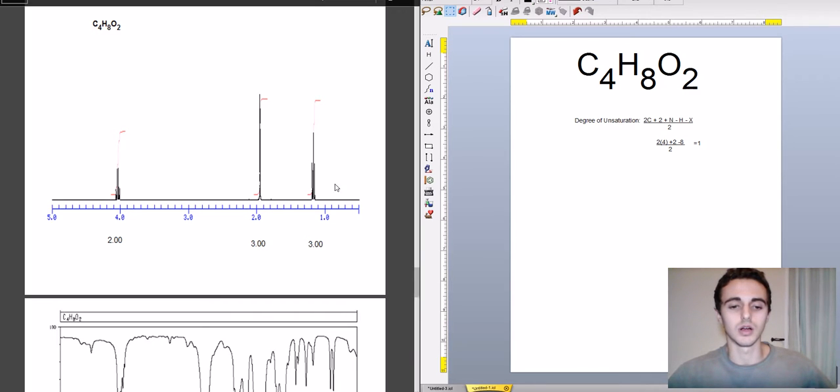Let's start upfield actually. Down here are your integration values. Hopefully they'll be given to you. If not, you'll need a ruler and you have to know how to go between peaks. I might do that in a different video. Most likely they're going to give it to you in these introductory courses, because when you're seeing these on a test, you'll be in crunch time and won't have time to do all that. Anyways, here we go.